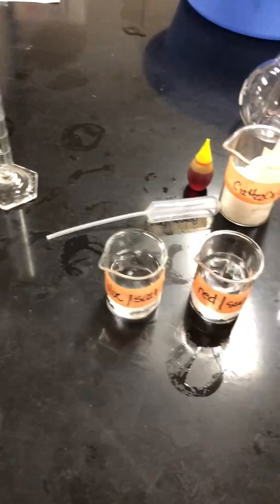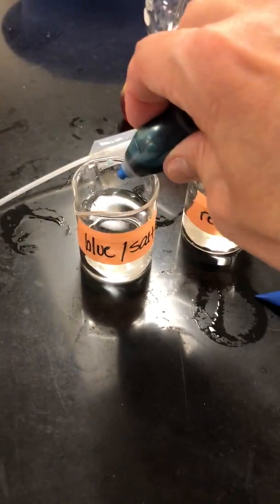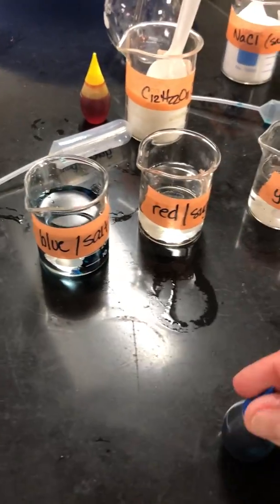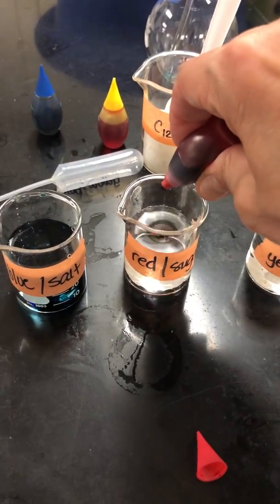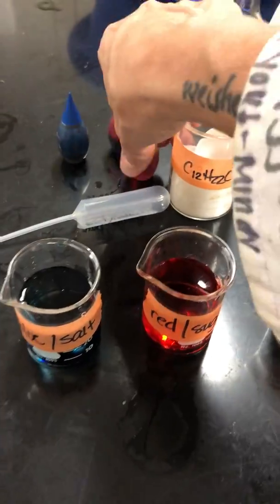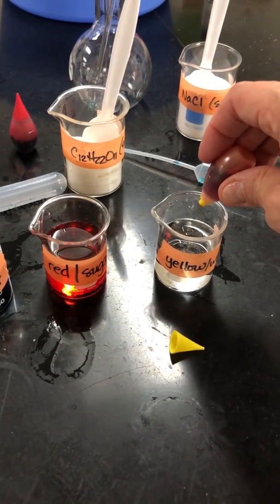Then it says to add the food coloring. So 2 drops in the labeled. So this is blue. It says don't stir yet, and that's so you can see the wonderful diffusion. You're not gonna have to stir it at all to get the coloring mixed evenly. The water particles will do that themselves.